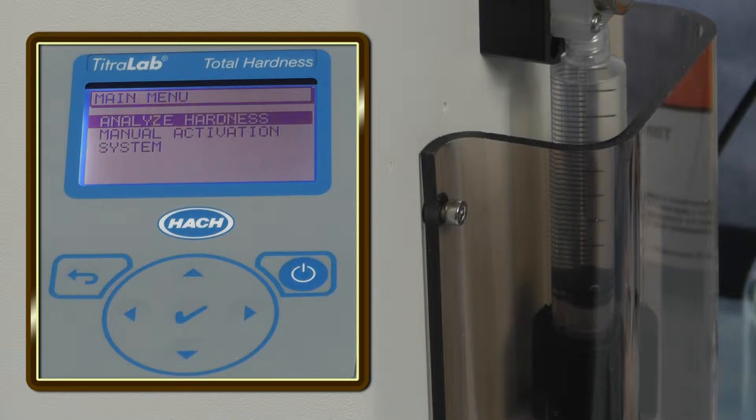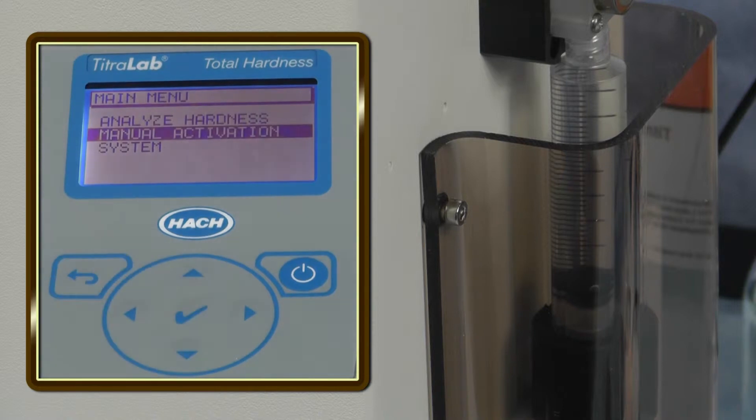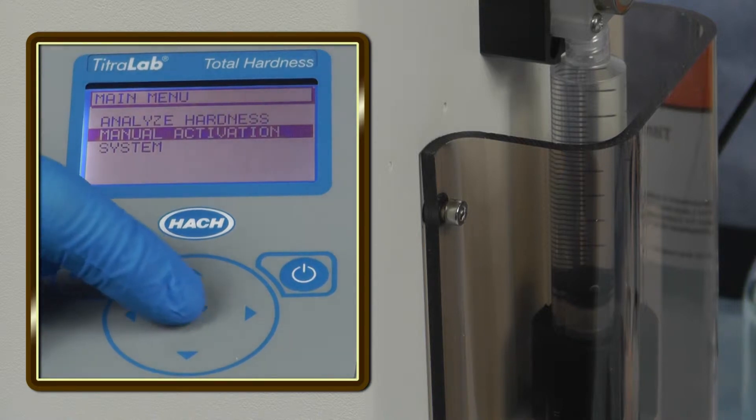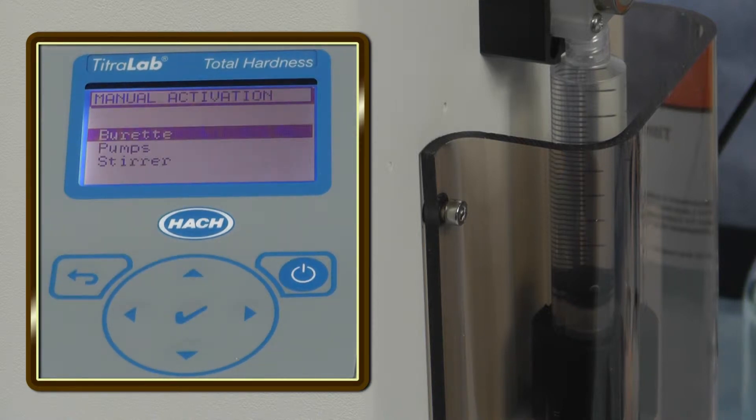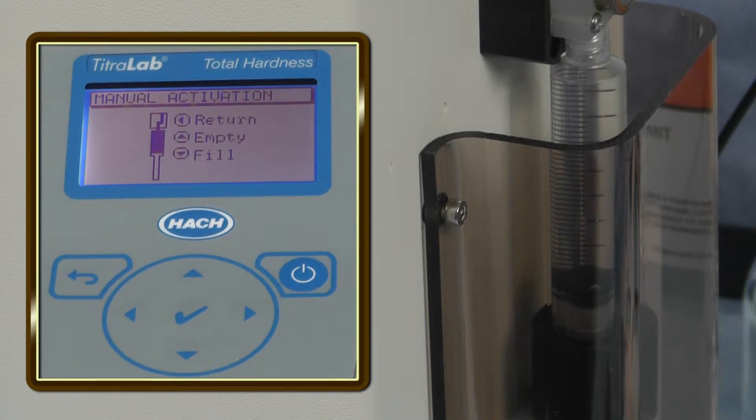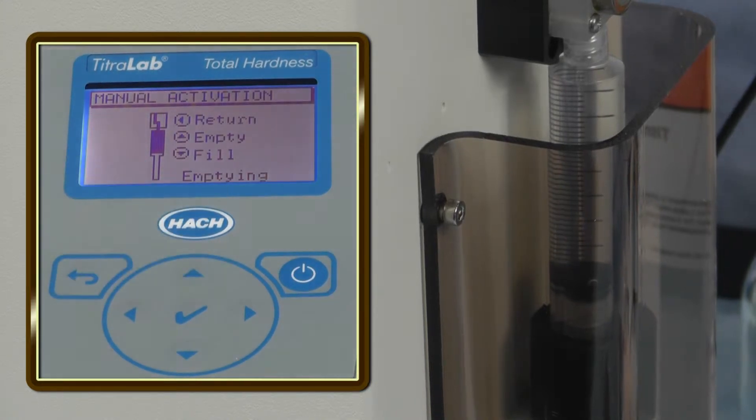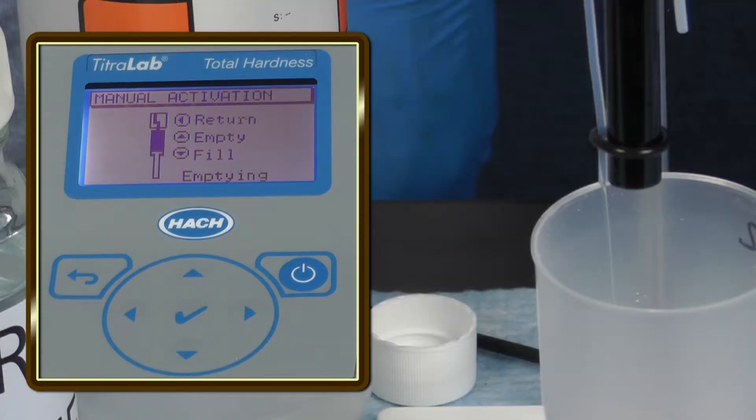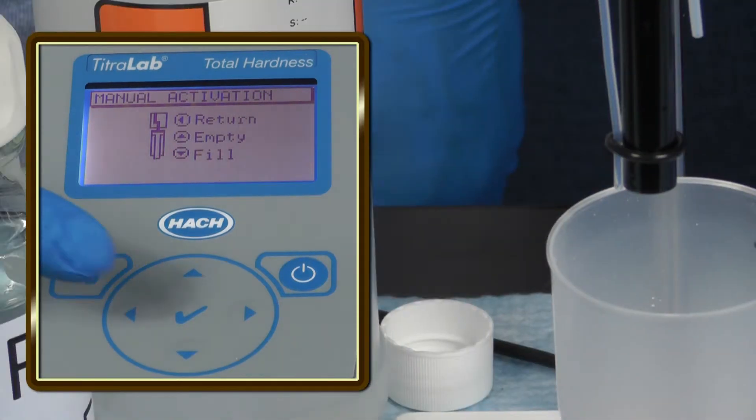On the keypad, scroll to manual activation. Select burette. Make sure there is a waste beaker under the electrode. Press the up key to empty the syringe and the down key to fill the syringe. Do this several times until all the air is removed from the syringe and the tubes.